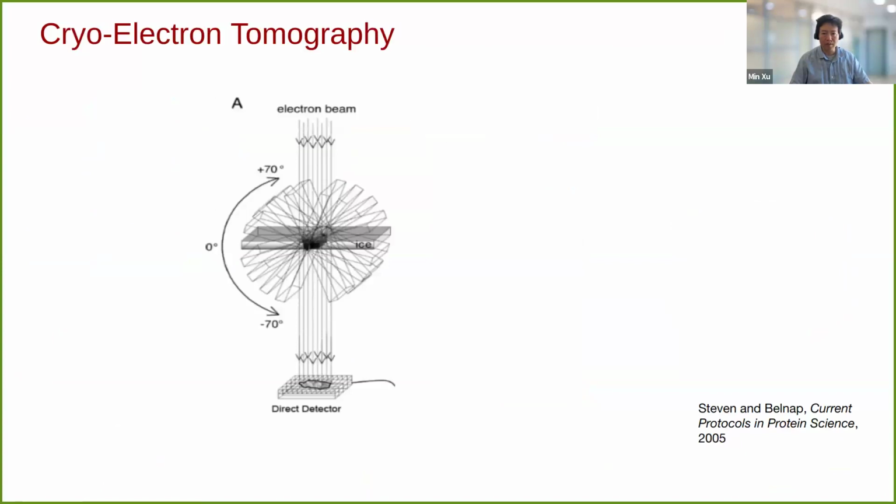Ideally, we want to directly visualize all structures and spatial organizations of all macromolecules together with other subcellular components inside a single cell. However, this information has been extremely difficult to obtain due to the limitations of the data acquisition techniques. Nevertheless, the recent development of cryo electron tomography technique has made such information acquisition possible.